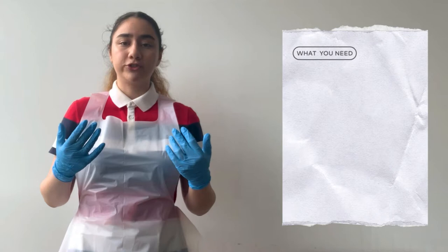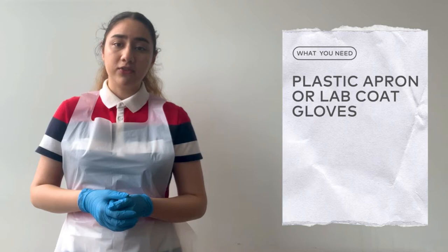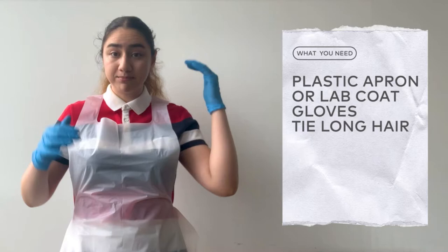The first thing is safety. Before doing any scientific experiments, you need to make sure you are safe from the chemicals and chemicals are safe from you. So for today's video, you will need a plastic apron or a lab coat and a pair of gloves. You can find both of these at pharmacies or drug marts or order them online.